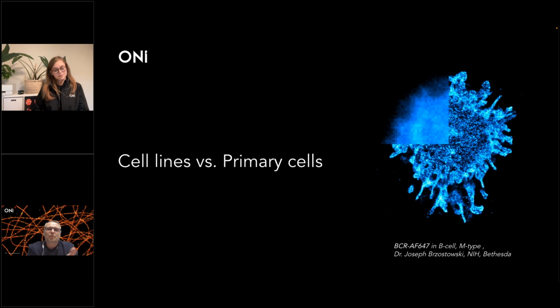And in terms of permeabilization, as Laura was mentioning, yes, you can permeabilize. You can use a soft permeabilization method, which is reversible, such as saponin, especially if you're looking for proteins in a membrane, so that you don't want to really open the pores in a membrane permanently, but you want to open them and they can close.